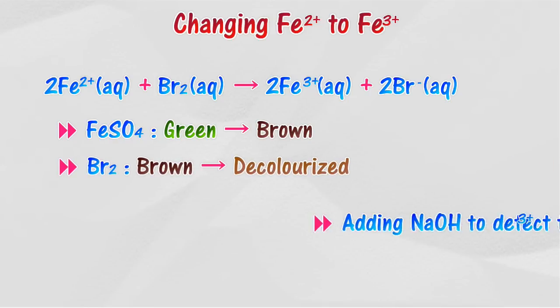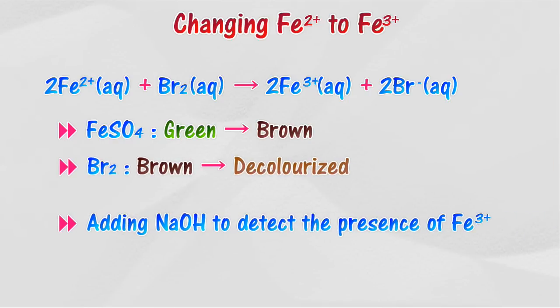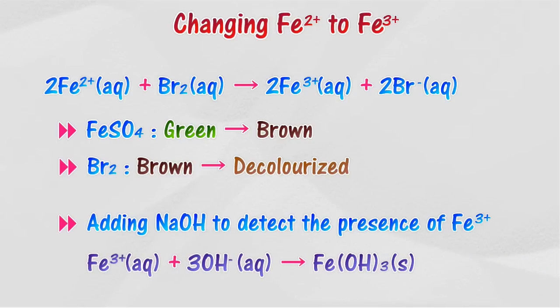The presence of Fe3+ ion as a product of the redox reaction can be detected by adding sodium hydroxide solution. A brown precipitate, Fe(OH)3, is produced.